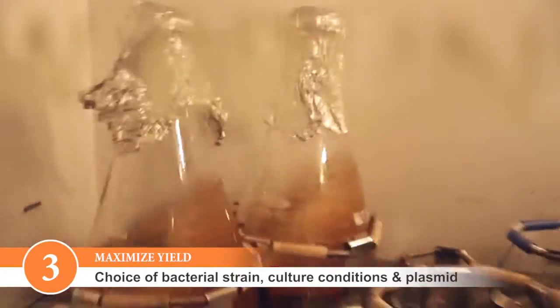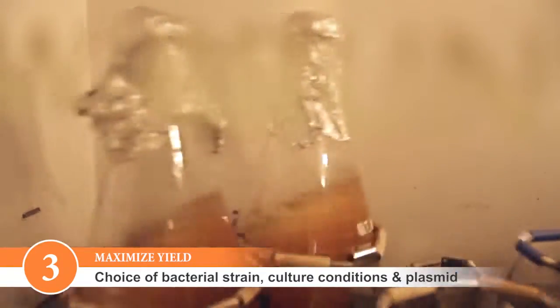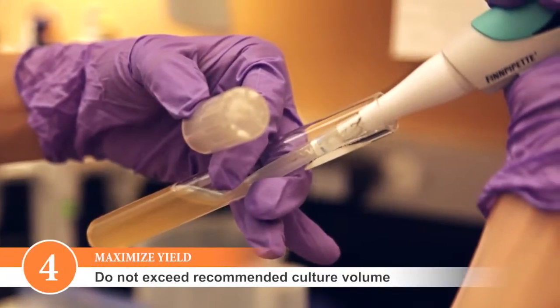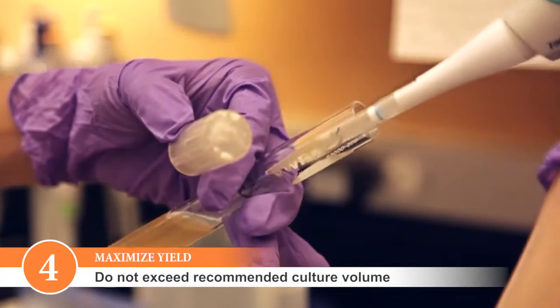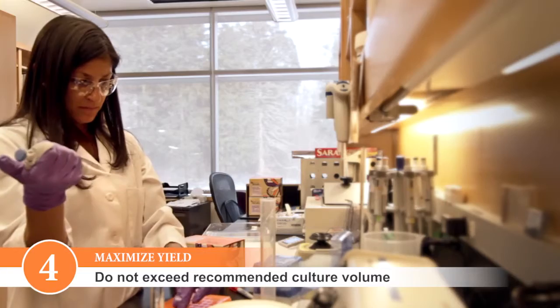Please keep in mind that the amount of plasmid DNA you can obtain from a culture depends on the strain of E. coli used, the culture conditions including the media used, and the plasmid copy number. Be careful not to use cell culture volumes that are larger than those recommended, as this can limit the efficiency of lysis, resulting in lower purity and lower yields.